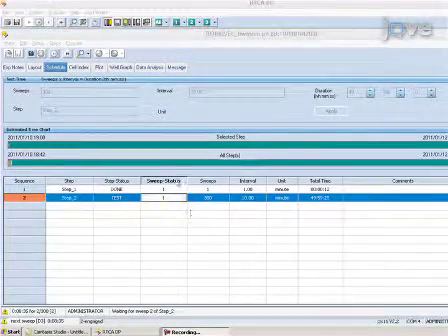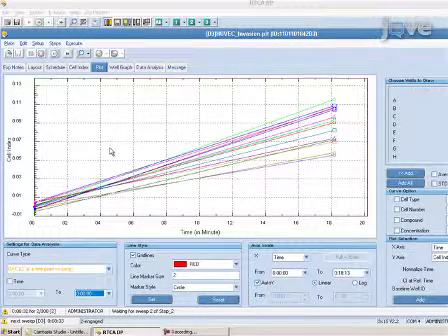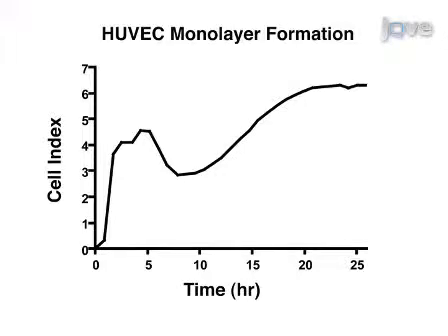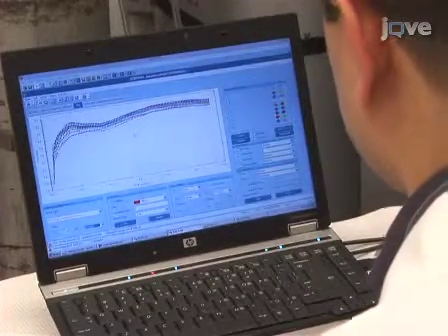Allow the endothelial cells to grow. The system will continue taking impedance readings every 10 minutes. HUVEC show a characteristic transient flattening of cell index 4 to 6 hours after seeding, followed by another stabilization after 16 to 18 hours. Hence, it is important to let the cells form a confluent monolayer for at least 18 hours. Once a monolayer has formed, it is time to add the invading cells.